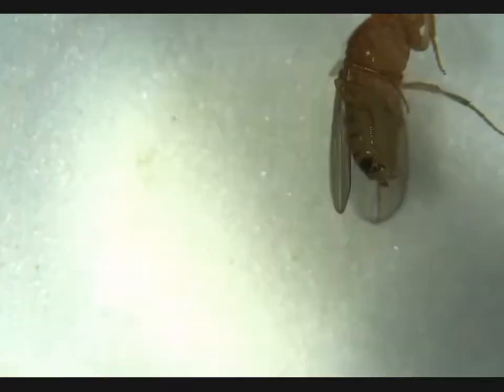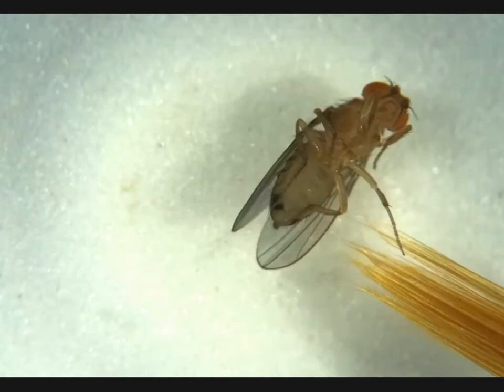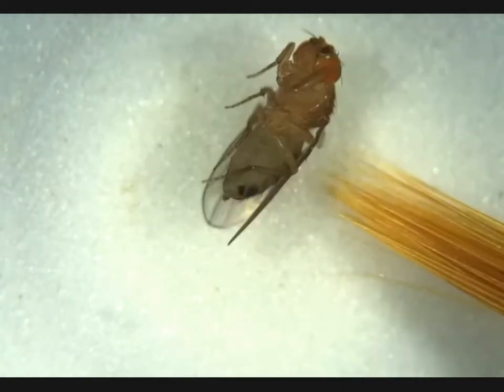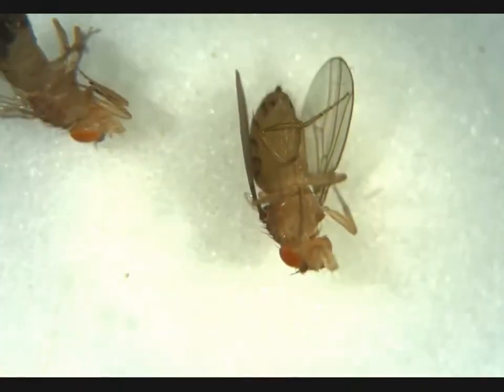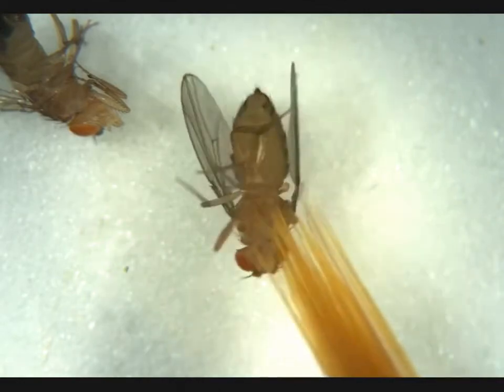This is a female we can see. No penis apparatus, no obvious meconium. We'll call her adult.